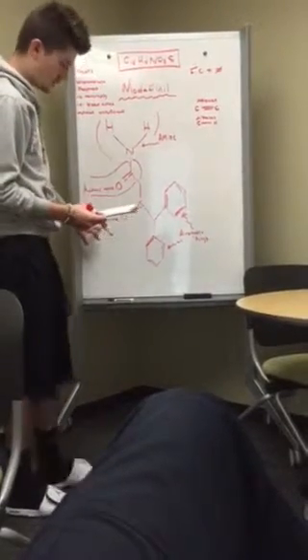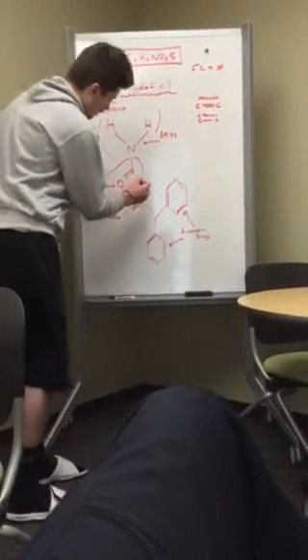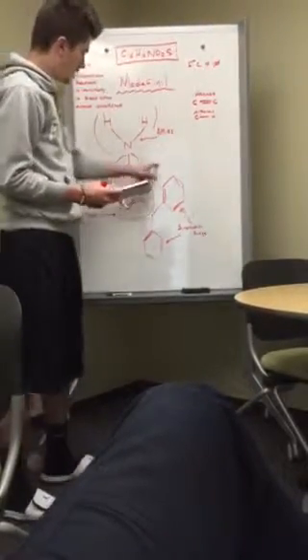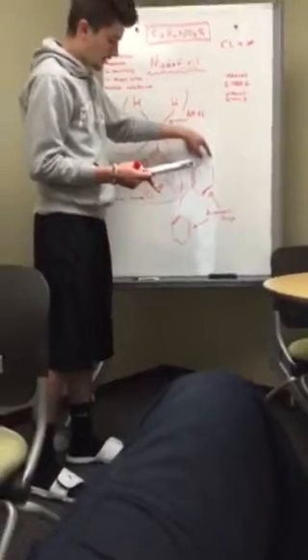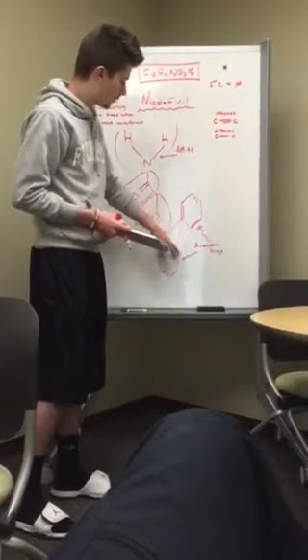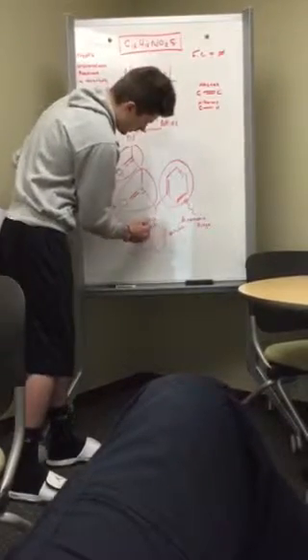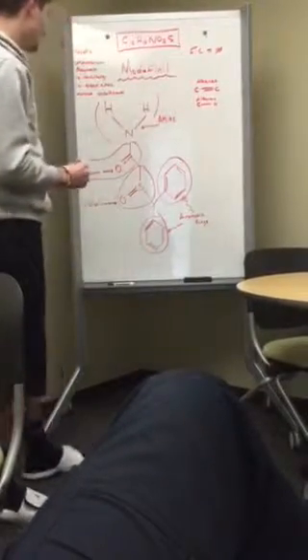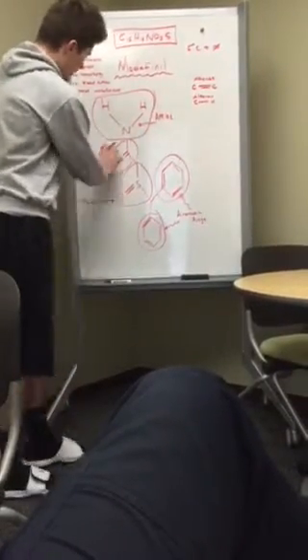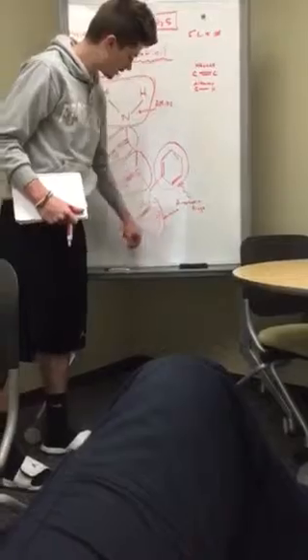Then as we go to this thiol, we have an IR spectroscopy frequency of 2550, which would be starting right here and going to here, being this group. As we go to these aromatic rings here, these have a frequency of 1400 to 1600, and they're both the same because they're both identical aromatic rings. So these are labeled here and here as the 2 aromatic rings. So like I said, this amide is here, the ketone is here, the thiol is right here, and then we have 2 aromatic rings here.